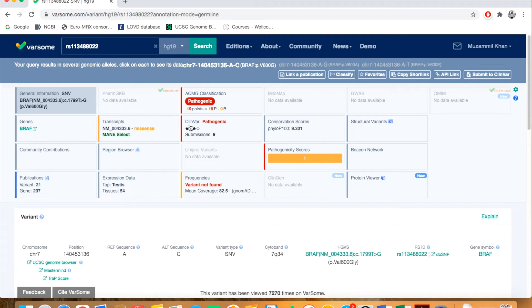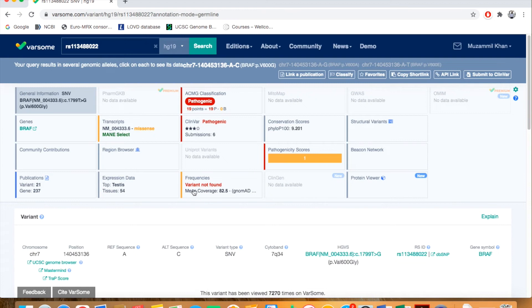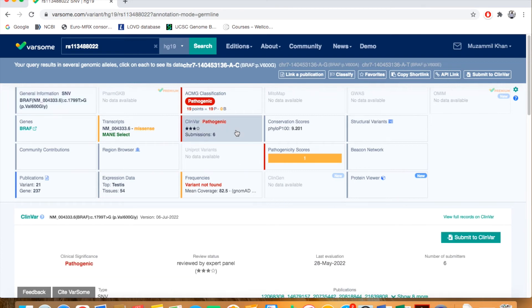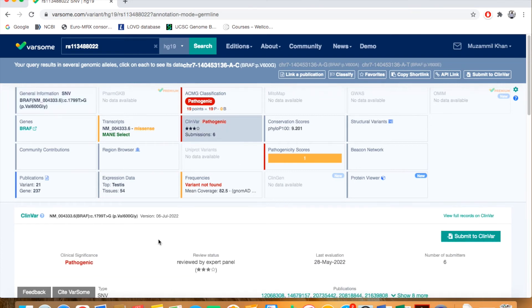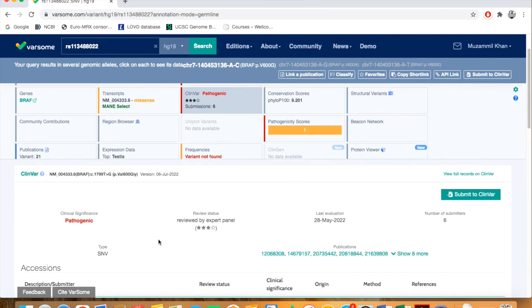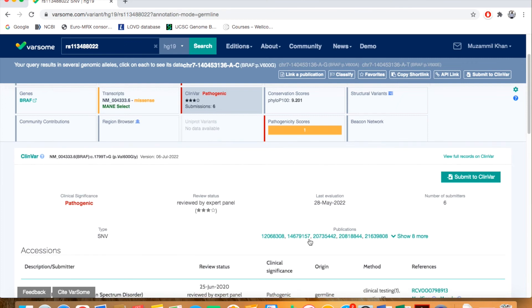This variant is reported in ClinVar. These are all the tabs, so if you click on a tab you will be directly navigated to the evidence information. For example, if you see 'variant not found,' you can click here and scroll down. You can see here that in ClinVar it is reported to be pathogenic.